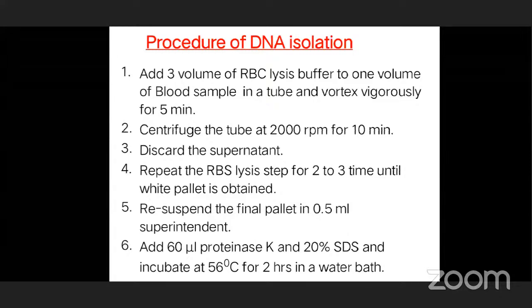Mix these chemicals for 5 minutes. Take blood and add 3 volumes of lysis buffer or distilled water. Then mix vigorously for 5 minutes. Also, here inward mixing is okay.